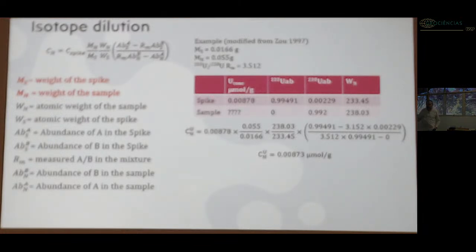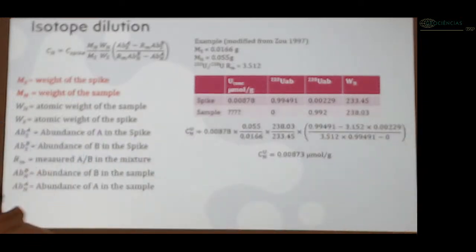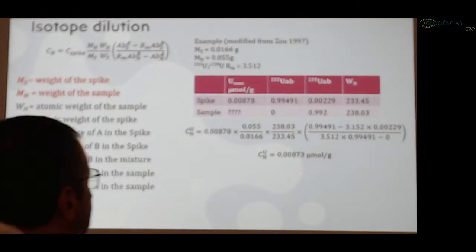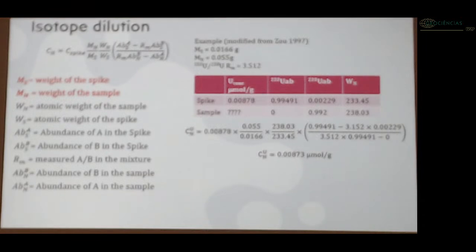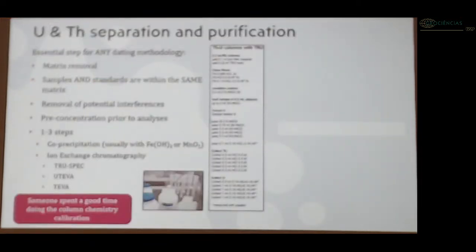One advantage of this is that this is very precise. You can apply some other methods that might be available, that are used in other techniques, but because we're measuring ratios here, this is an extremely more precise measurement than measuring the absolute abundances of each isotope, and therefore these will come with an uncertainty of lower than 1%, sometimes even lower than 0.1%. So these are very, very, very precise measurements.